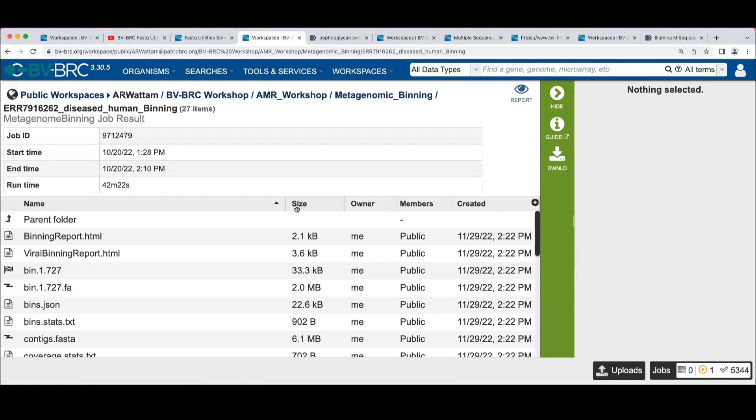Something that reminds me, remember we started this looking at the original SRA dataset that had the human reads in it. So do you have any guess what's going to happen to those human reads when we do the binning?